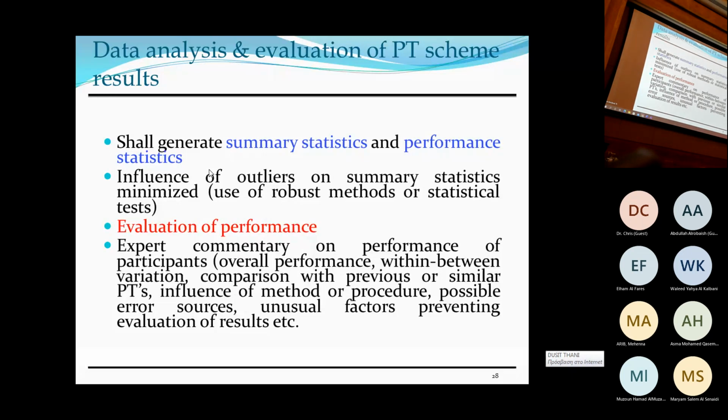So where do you get your ILC services from? From GulfMed. So who does the piloting? Who calculates the reference value? Okay, so I think that they report how they do it, right?